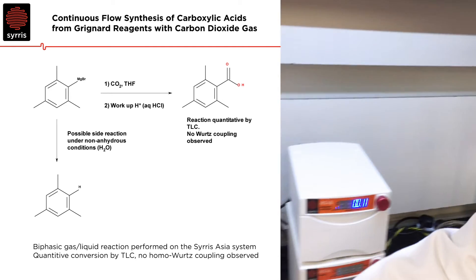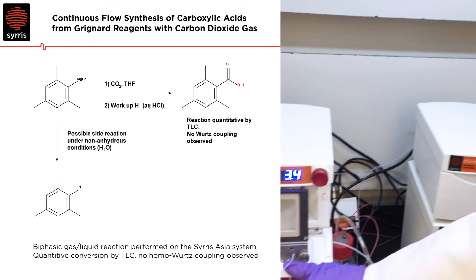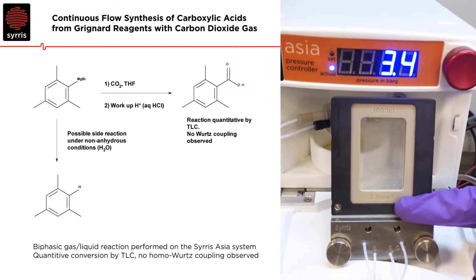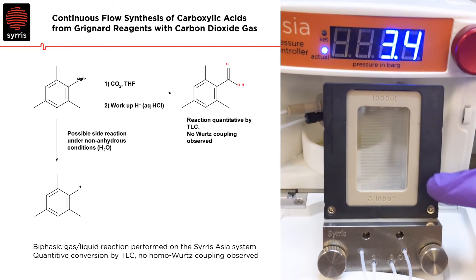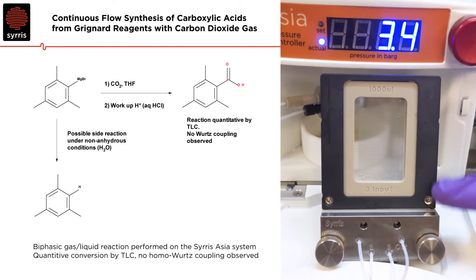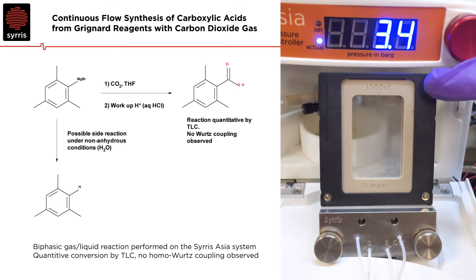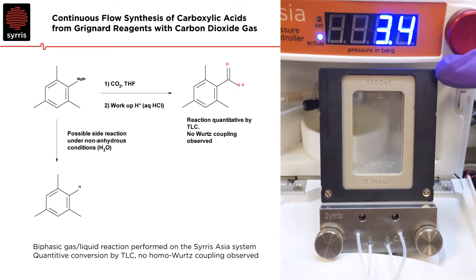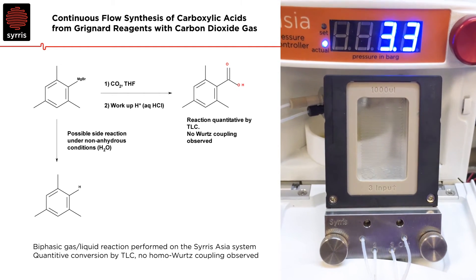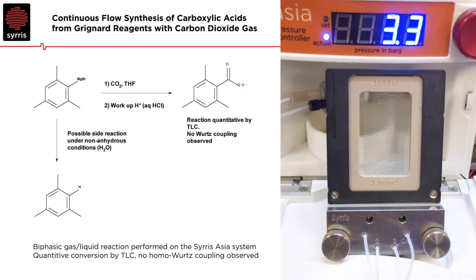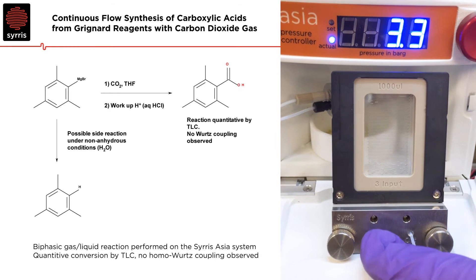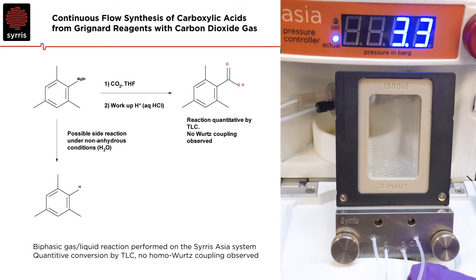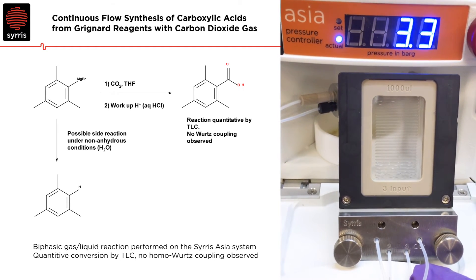Our gas is being introduced into a three-input glass micro-reactor. This example is a 1000 micro-litre reactor, and we have reagents going into one port and solvent going into the second port.